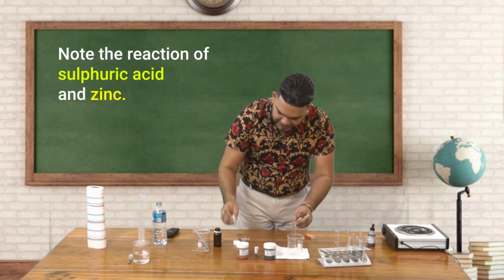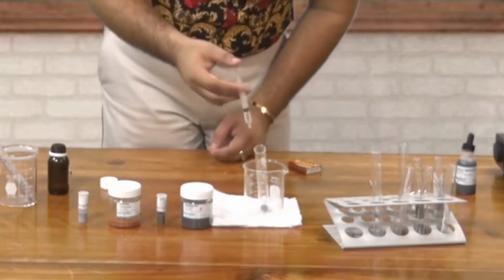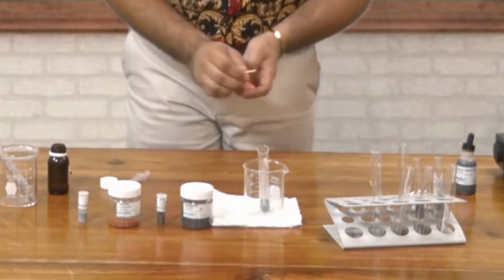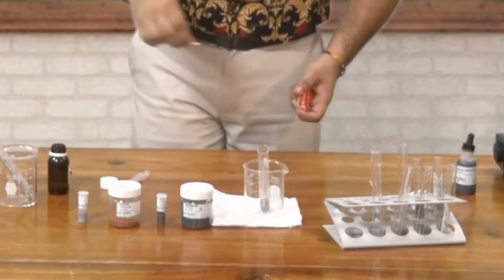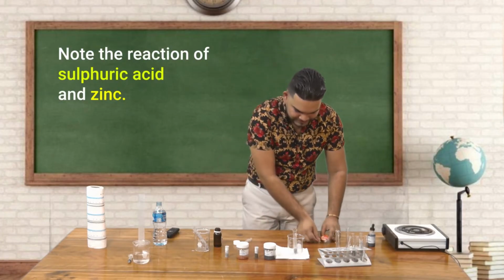Lastly, students, we will look at zinc. Sulfuric acid to zinc. Oh, look at that. Let me try and see if we can capture some hydrogen. Woo! You saw that and you heard that. Excellent. That's your popping sound. That is what I would have expected you to hear at the first instant we would have done it.